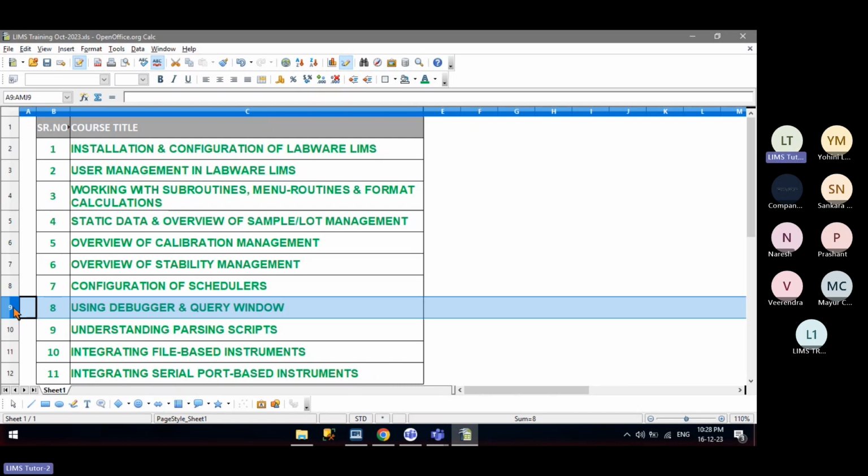Currently, I am facing some challenges in other applications like EDMS. I've been assigned multiple quality applications to support, not just LIMS, so I don't know how to debug. And the guys who were earlier involved didn't provide proper KT. Knowledge transfer was not done properly, and by the time I joined, it was already completed. So for any application, if you are involved in the technical part, if you are from the IT side, you should be very clear how to debug whichever issue the user is facing.